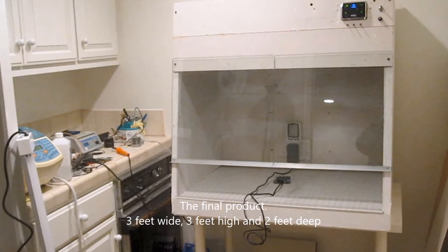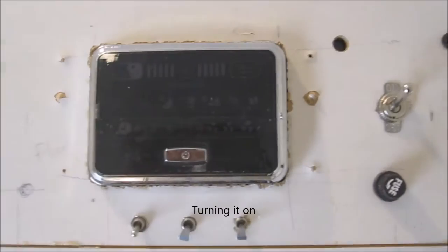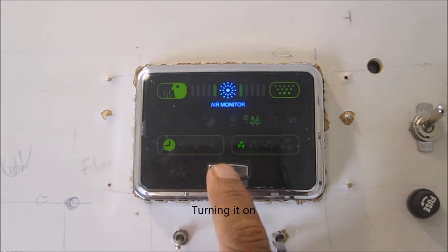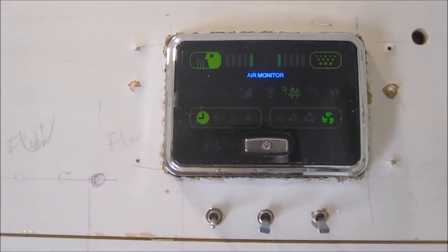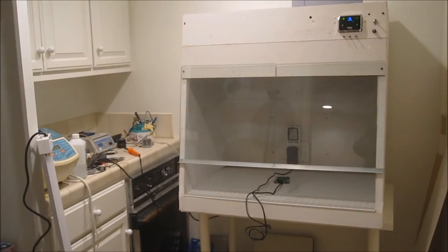So I went ahead and built one. This is the final product. The advantage is it's incredibly light compared to commercial ones, and you can see the size here. I reused the electronics from a domestic air purifier — it has a nice four-speed fan. I also added a booster fan which I'm turning on if you need rapid airflow.